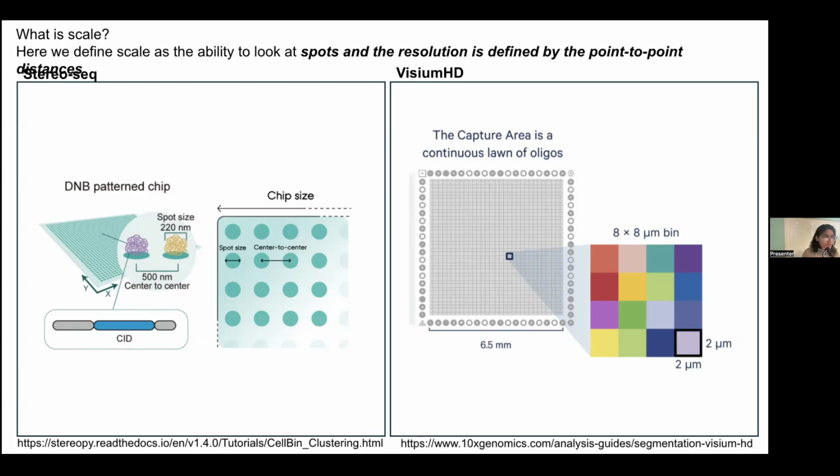Even then, it depends. I wouldn't recommend maybe a Visium; I'd definitely recommend a Visium HD or a Stereo-seq. But if you're going to do very holistic profiling of a tissue that's large enough, and you're not really interested in studying any of the minute reductionist details, then Visium would actually suffice. So when you know the range of your scales and the range of the tissue that you're investigating, all of this will guide you.